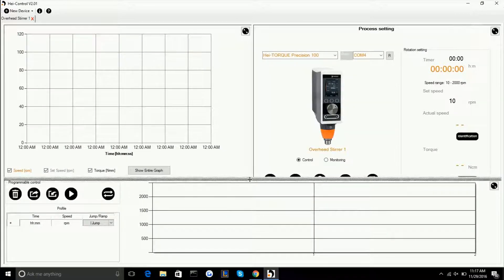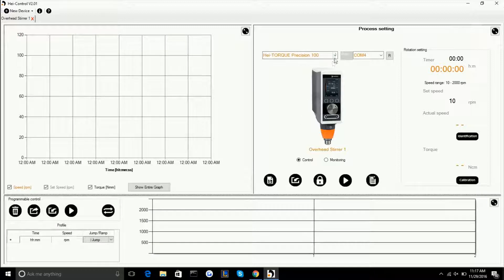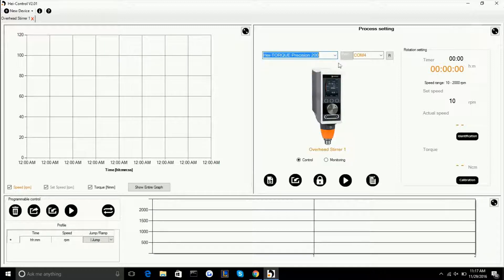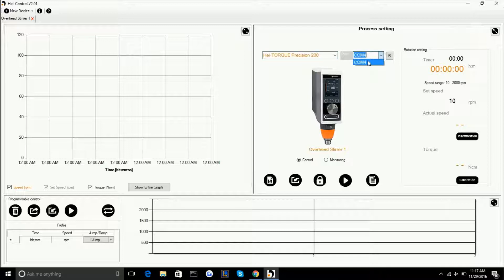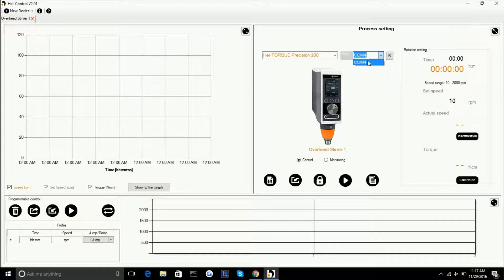First thing you want to do is to select the model of HiTorque Precision you're using. In our case the 200. Then you want to select the USB port that's going to be reading from because this software allows you to operate multiple overhead stirrers at the same time. So you want to make sure the one that is reading is the one you want to be using.